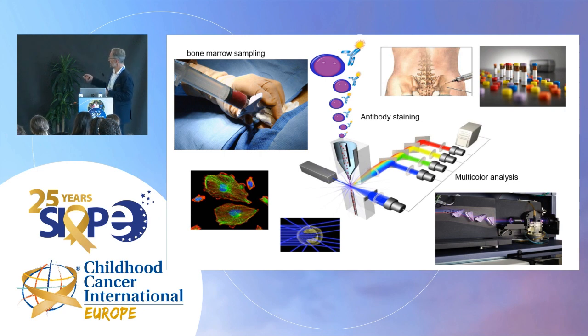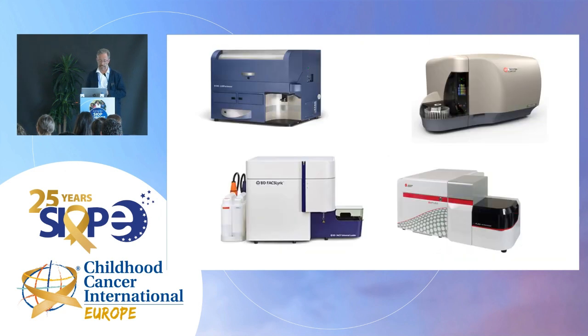after this incubation, the sample runs through the flow cytometer, and there is a chamber where there is one cell after the other walking through the light channel, and there is this fluorescence light sent to the cells, and then they start to glow, depending on the antibodies, and the antibodies are labeled with fluorochromes, and the different fluorochromes give back different emission spectrum. And that is recorded by a computer. And then you can have these nice plots, which I will show today in more detail.